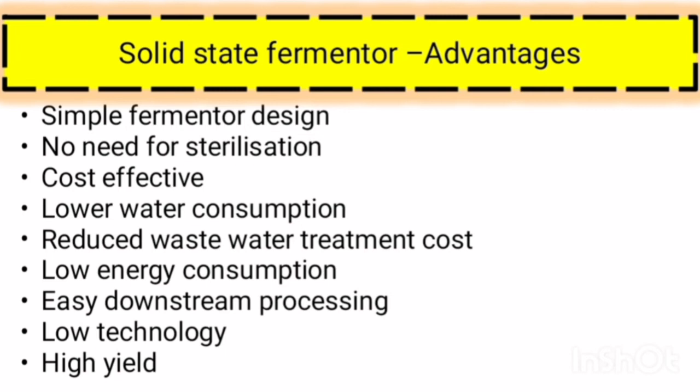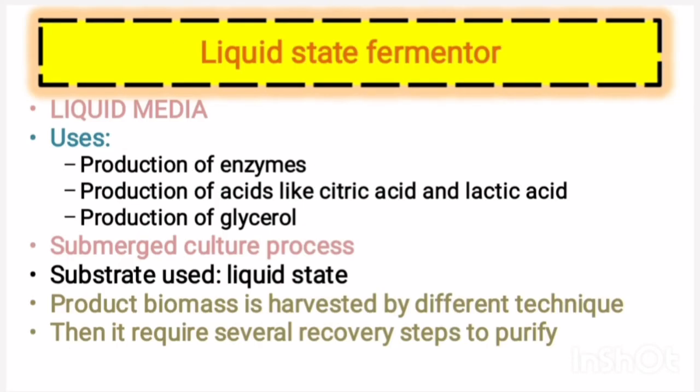Another one is the growth of the microorganism. The microorganisms grow slowly in the solid substrate. And also heat production creates some problems in the fermentation process. Solid state fermenter is over.